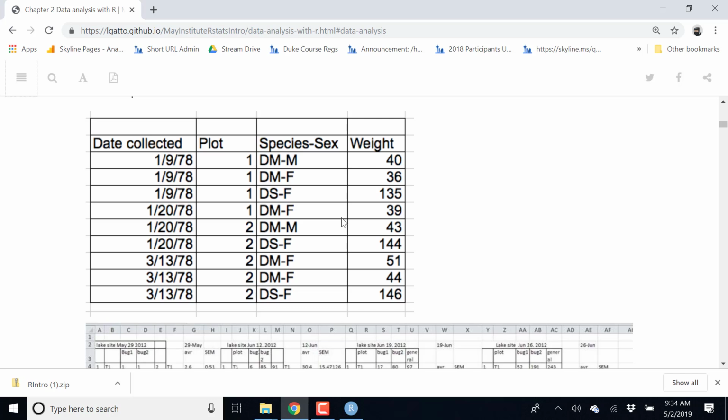Would it be critical if we change variables and observations? The variables would be in the lines, because for example, if we have proteins and replicates, then the observations would be proteins, right? Or replicate. So for the type of data analysis that we're going to go into later in the afternoon, typically you have your observations along the rows and your variables along the columns. Now, your observations could be different proteins, and then the variables that you have is an intensity, but then you could have intensities in different samples. I'm going to come back to how to encode these.